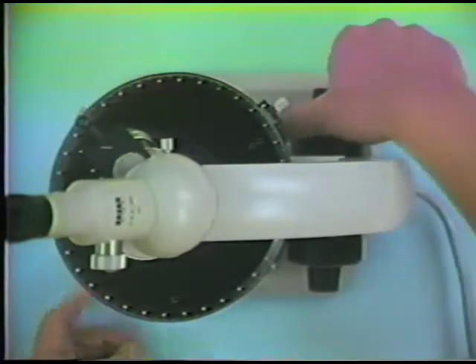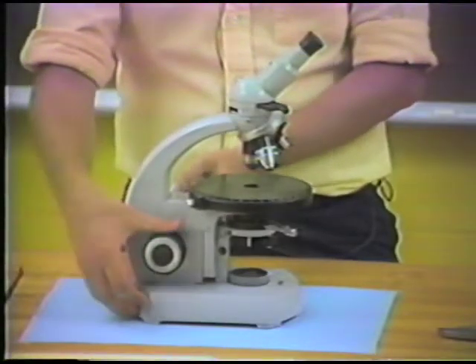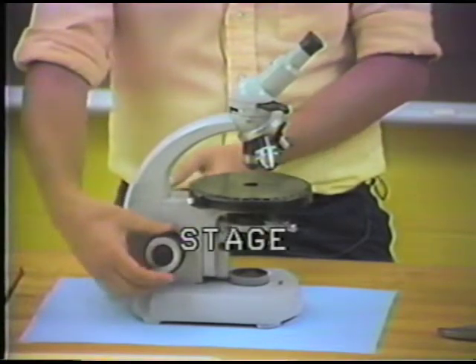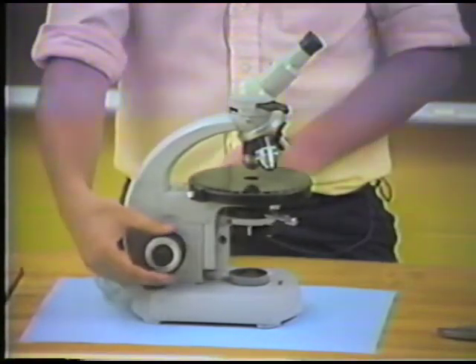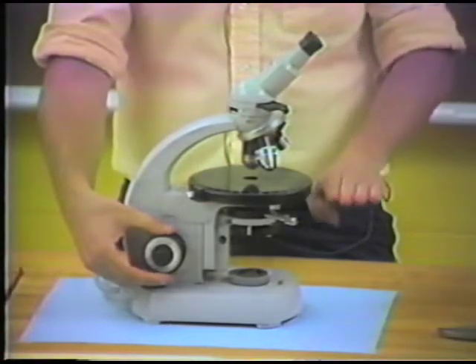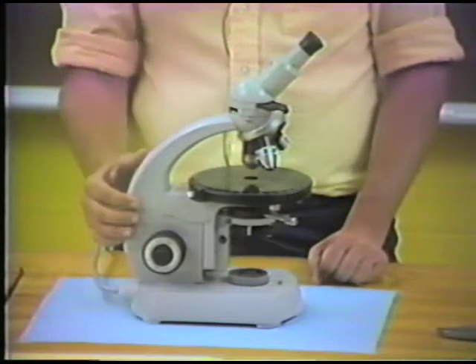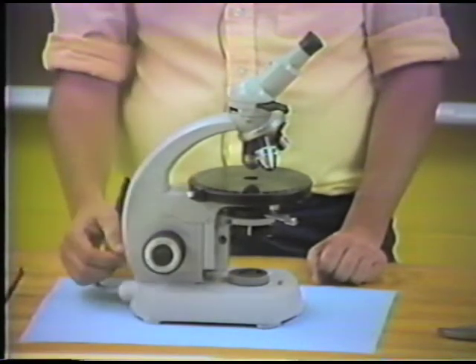If I move this very rapidly, you may be able to see the actual movement of the stage itself. Now it's lowering, and now the stage is actually rising, decreasing the free working distance. But obviously you have to move the plane of the stage until you get a properly focused image for the microscope. So we have a coarse and a fine focus.